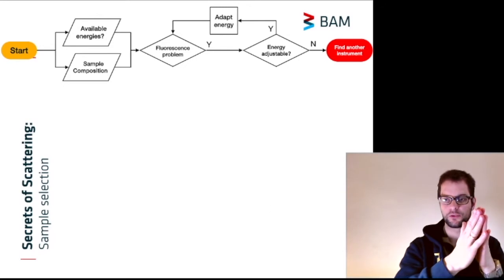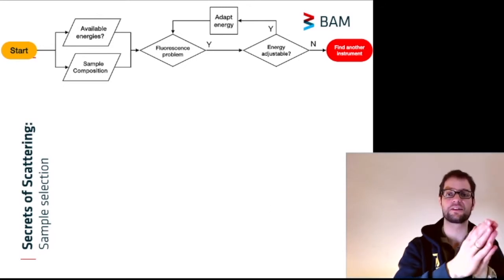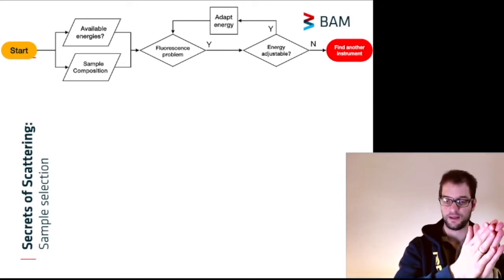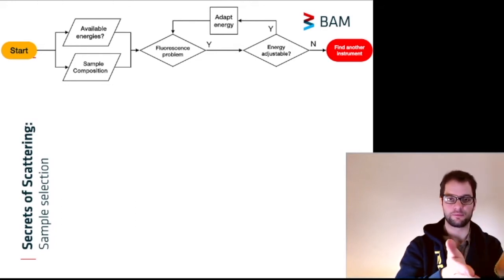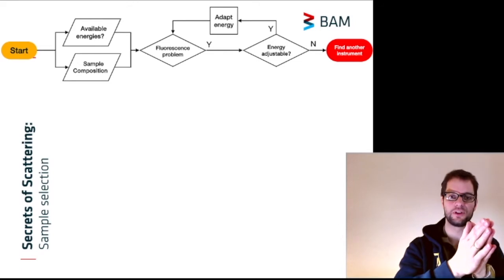For elements like that, it might be useful to switch to a different energy. If that's possible, change the energy and check if the fluorescence is a problem again then. If you cannot adjust the energy and fluorescence is a problem for you, then find another instrument. There are beamlines available where you can freely select or almost freely select energy that you need for your experiment.